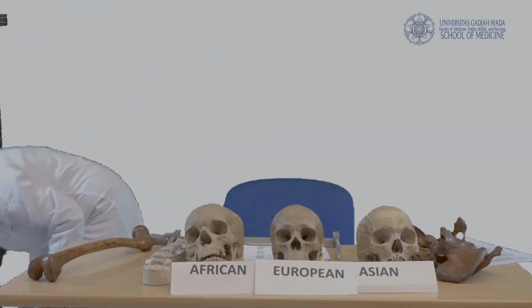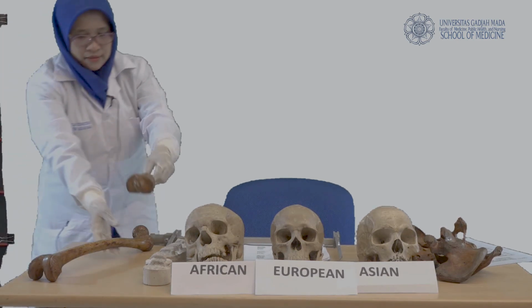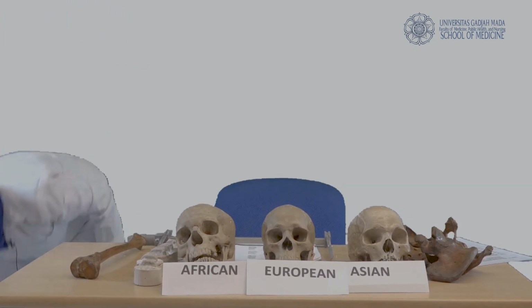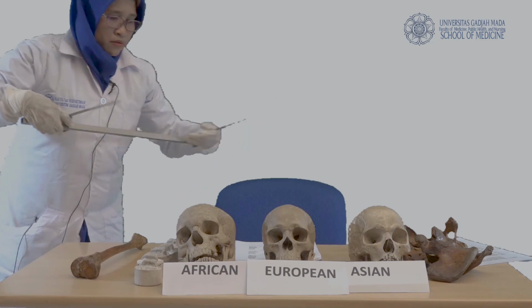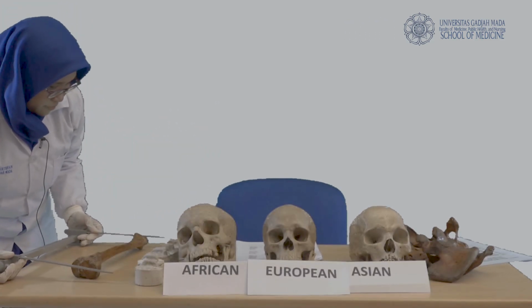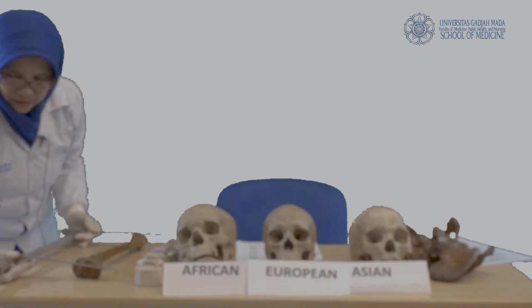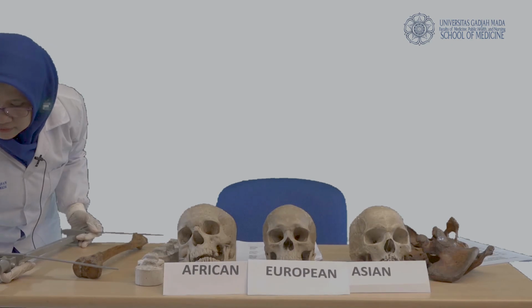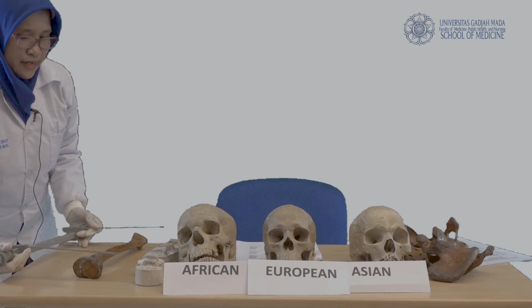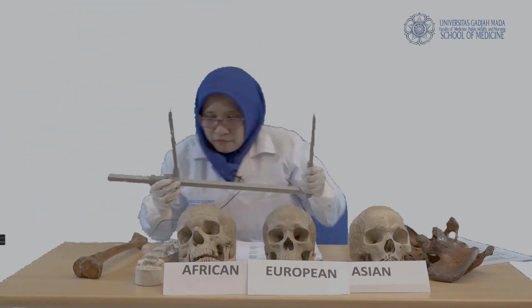In the other bones, such as tibia, it is similar. Measure the distance of the most outer parts of the bone like this, and then read the scale: 36.1. And then take the sliding caliper off.